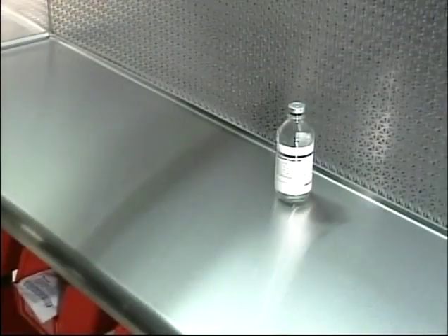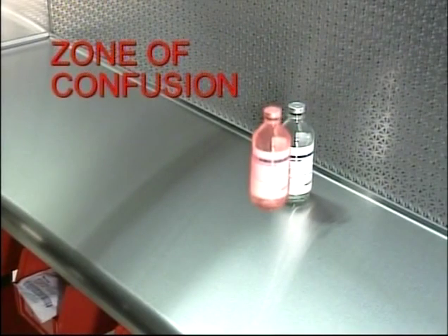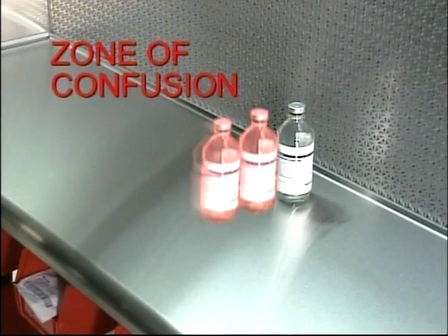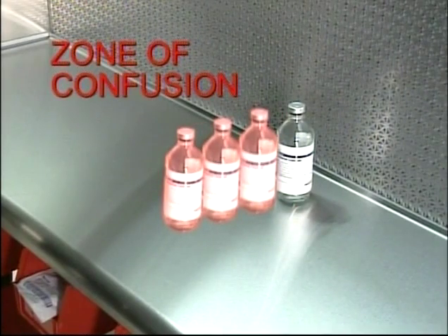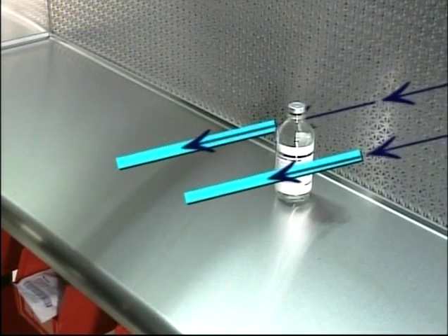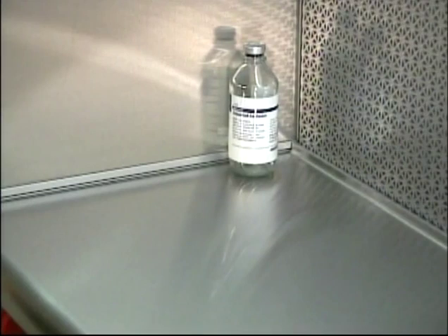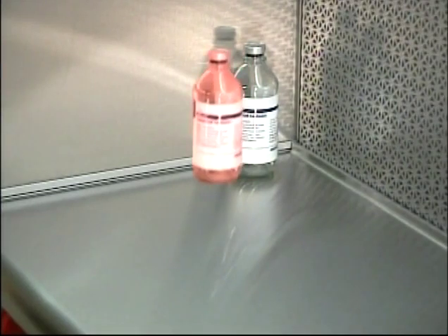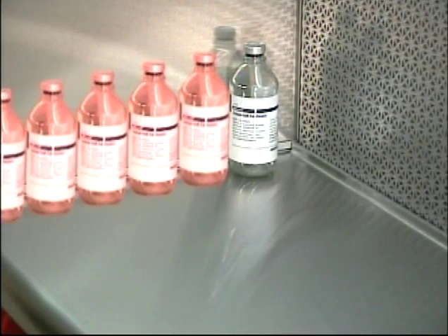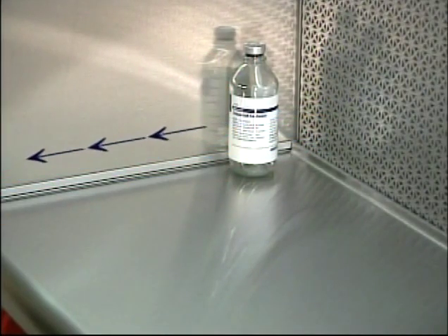An object placed into the LFCB creates a zone of confusion, which extends at least 3 object diameters downstream from the object toward the open end of the LFCB, provided there is laminar flow on both sides of the object. If the object is placed against or close to the side walls of the LFCB, this zone of confusion may increase to 6 diameters, because laminar flow occurs on only one side of the object.